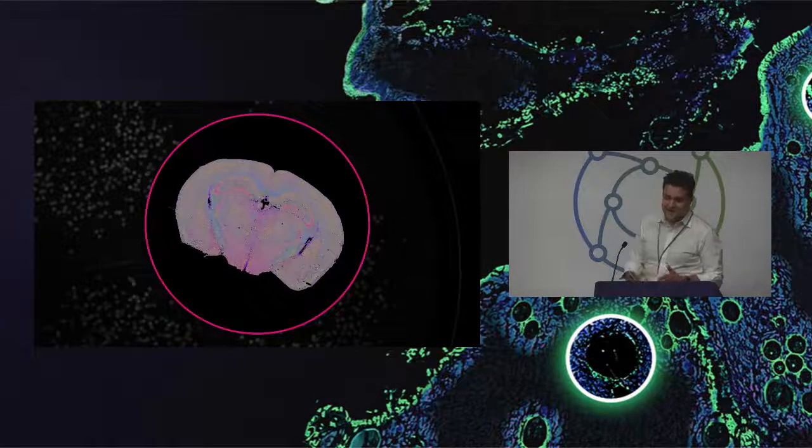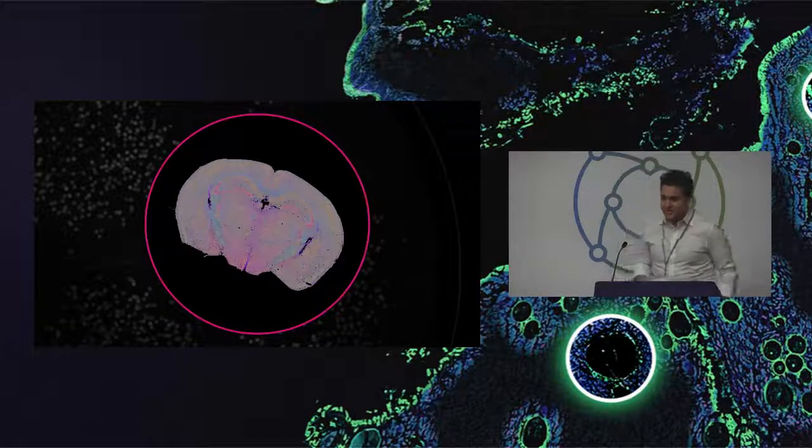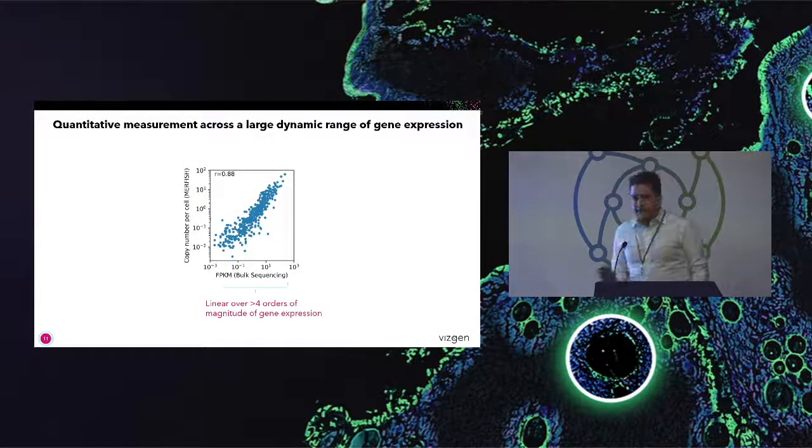So that enables analyzing the molecular composition of the sample all the way from single molecule to subcellular, to neighborhoods, to tissue microenvironments, all the way up to the macro tissue level scale. And you have this information across the whole tissue, not just at specific points that you've selected across the tissue. But for any measurement, it has to be both highly quantitative and give high quality data.